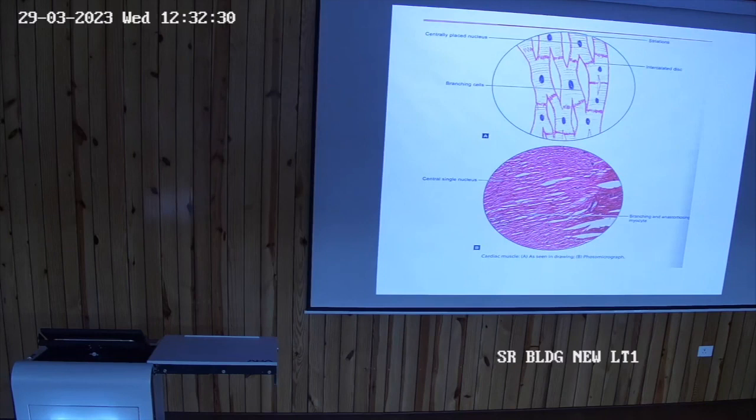And if some examiner asks, show me the intercalated disc, then reply, sir, this is the section that we are seeing under the light microscope, in which we cannot see the intercalated disc.